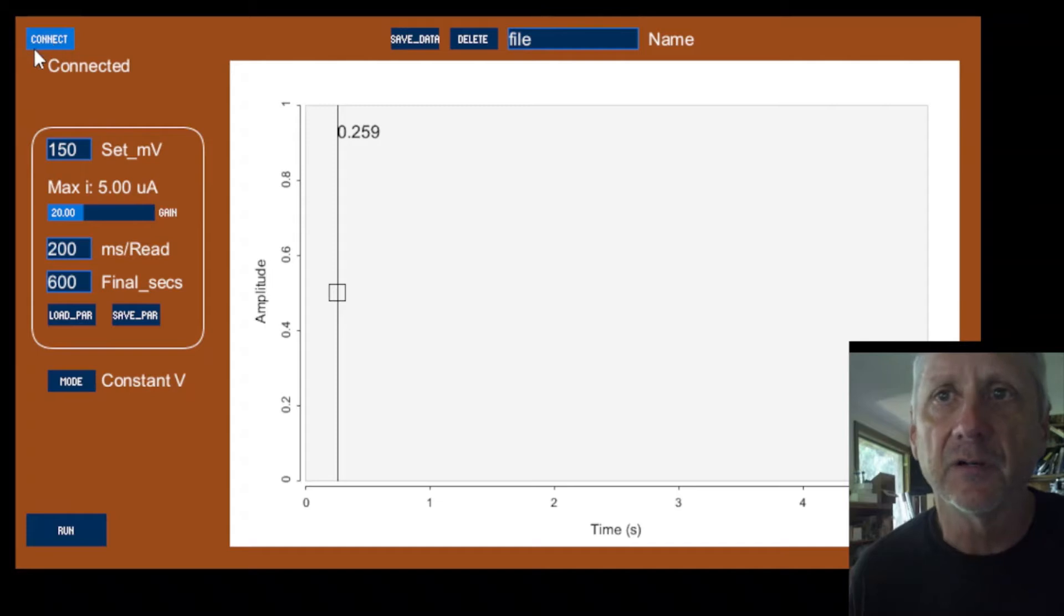Alright, so we are connected to the Raspberry Pi. We have a bunch of different parameters we can input. We have a voltage set. We can set the millivolts. It's 150 now. We can change that. We can change the gain.